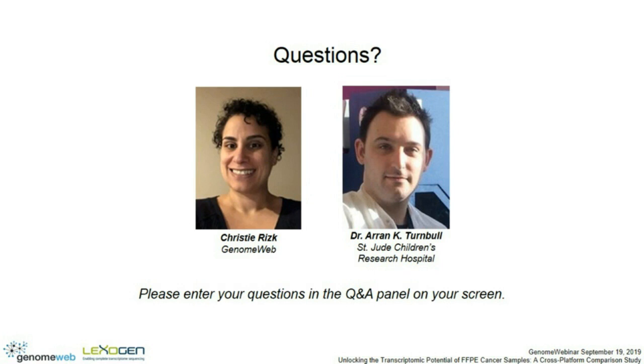All right. Our first question: would the correction methods that you talked about work if there's a combination of different subtypes in the samples that are being analyzed, for example, ER positive mixed with ER negative? That's a very important question, and this, I suppose, I didn't go into in too much detail. This really goes back to the point I mentioned about selecting appropriate data sets to combine.